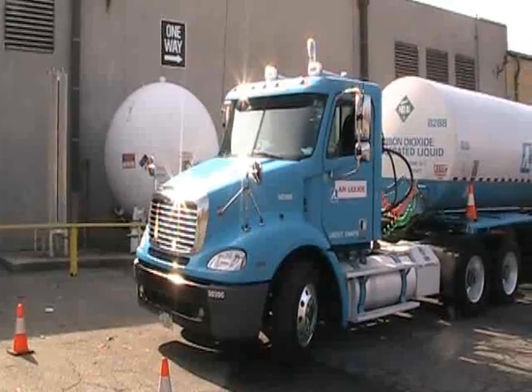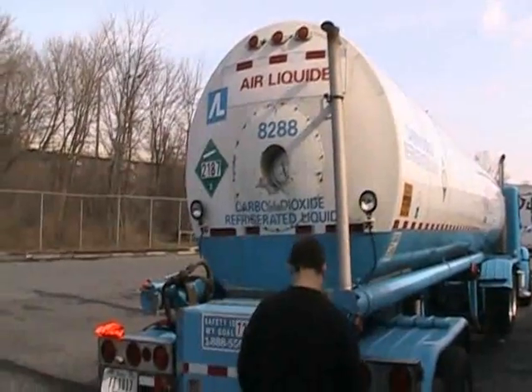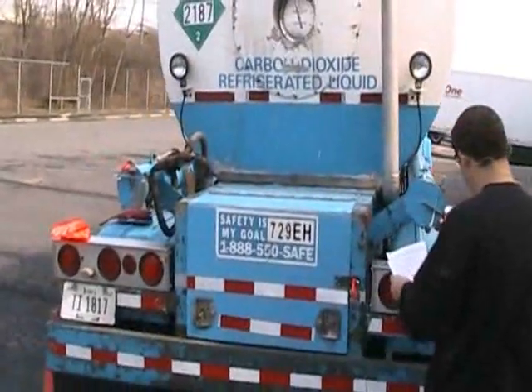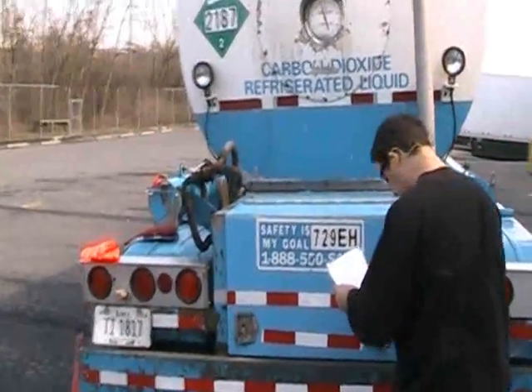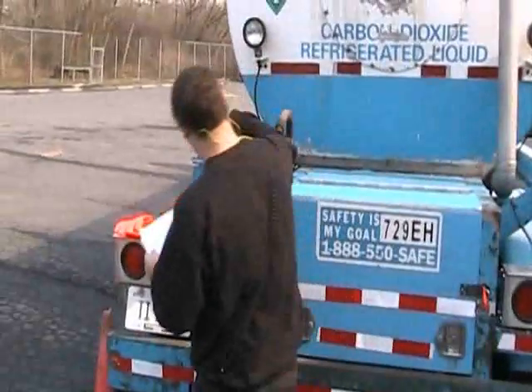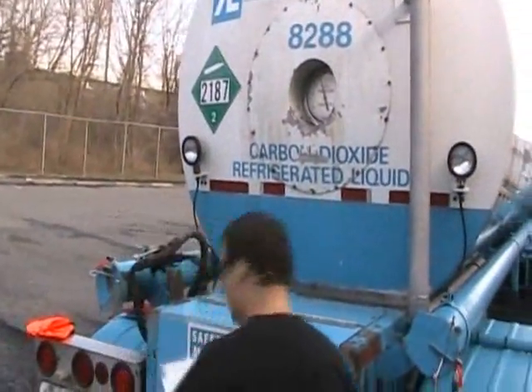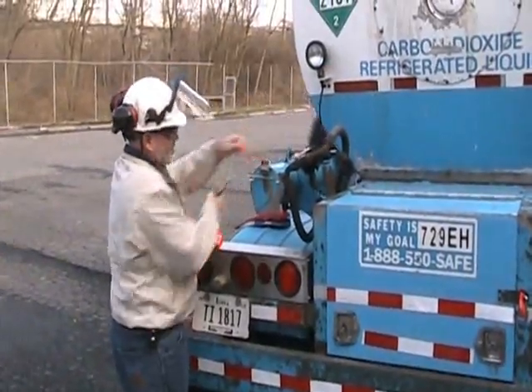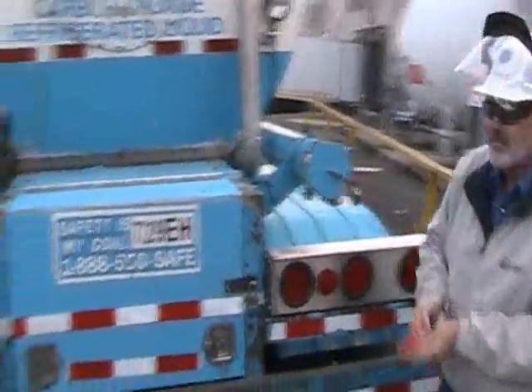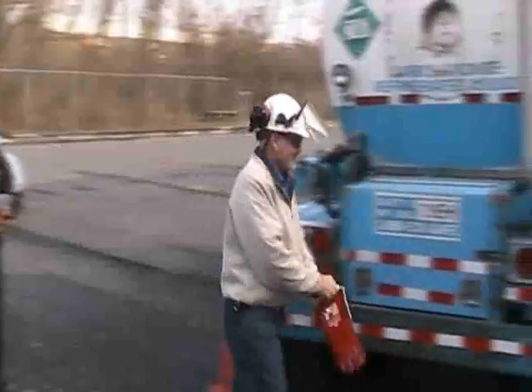Other QC personnel should follow all tank truck delivery inspection protocols, including confirming the truck identification number and receiving and checking all necessary CO2 load paperwork from the driver against their internal documents. Check all truck security tags for integrity and proper identification number match before the truck driver removes any security tags. Once all receiving paperwork and security checks have been made, the truck can be prepared by the driver for proper CO2 handling procedures to be performed by the bottler's QC staff.